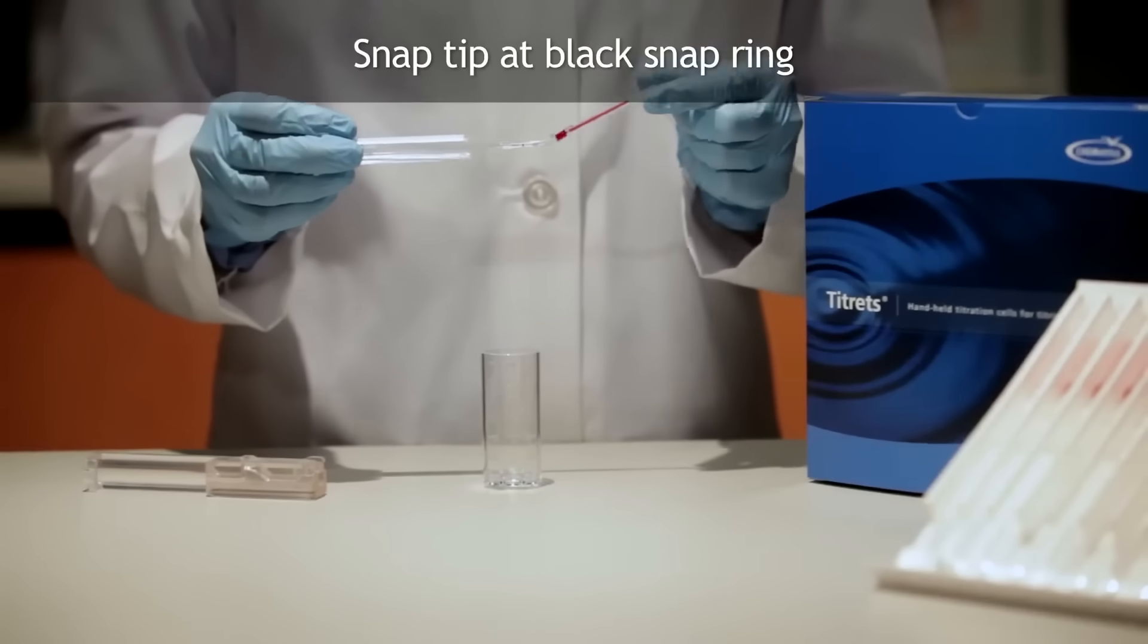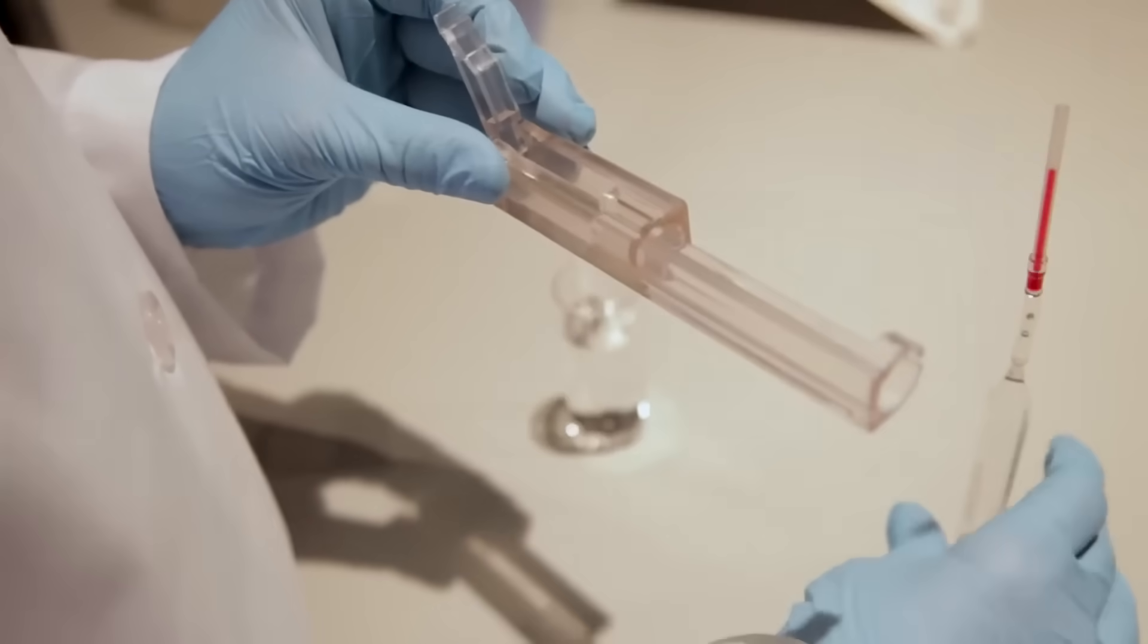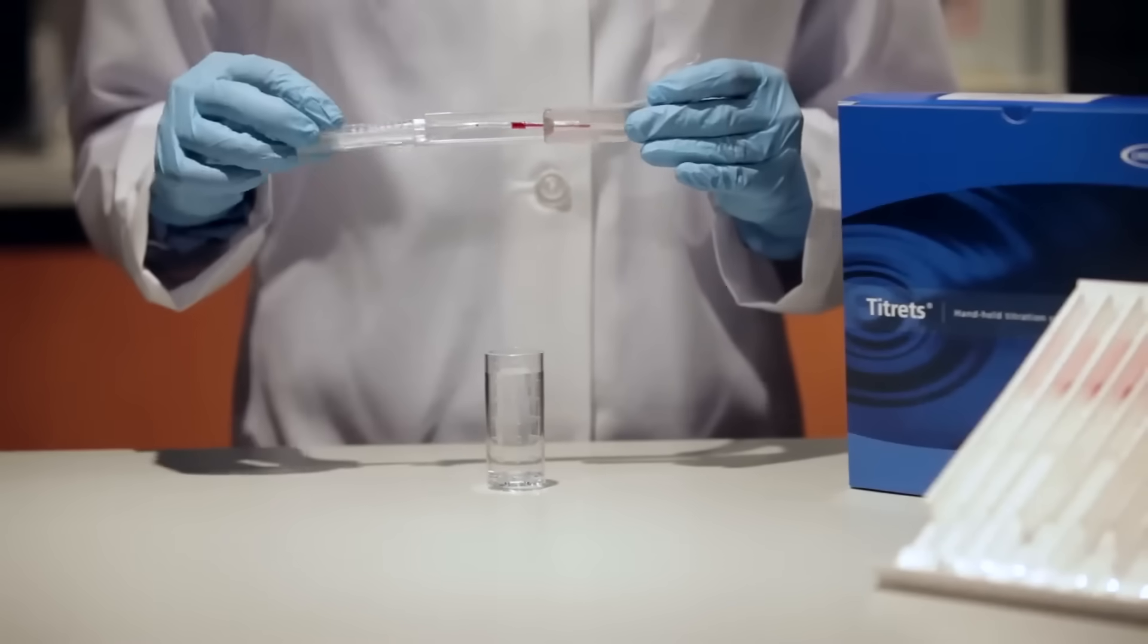When the tip is snapped, the flexible tubing will remain in place on the tapered neck of the ampoule. Lift the control bar and insert the titret assembly into the titretter.